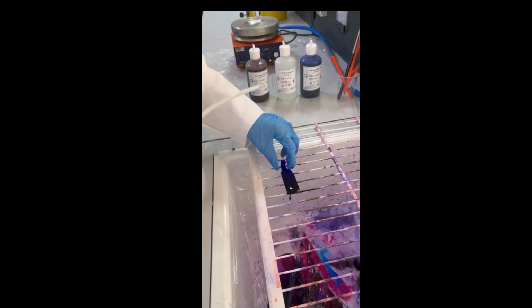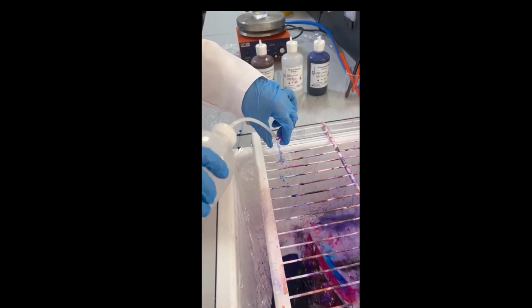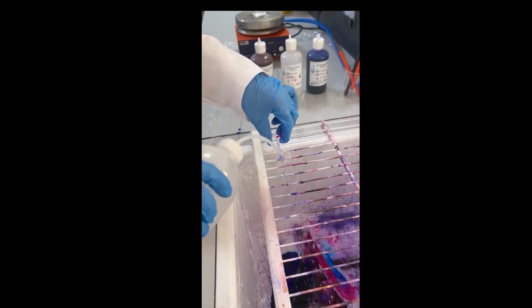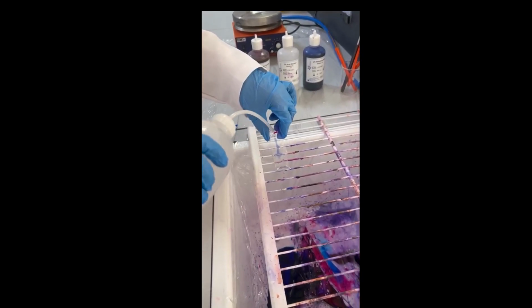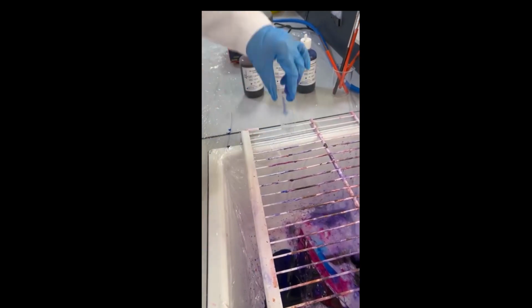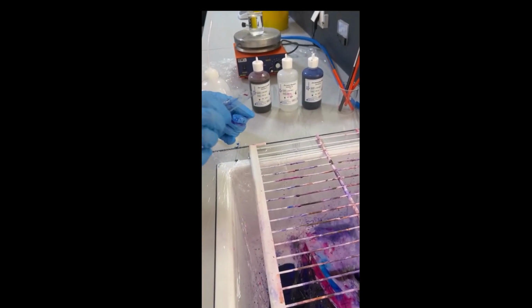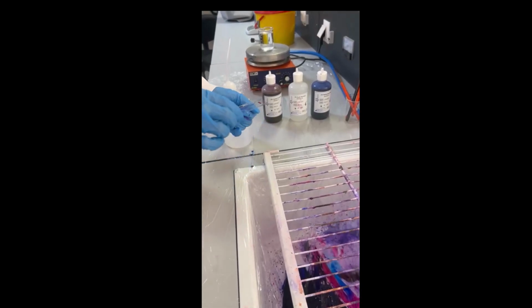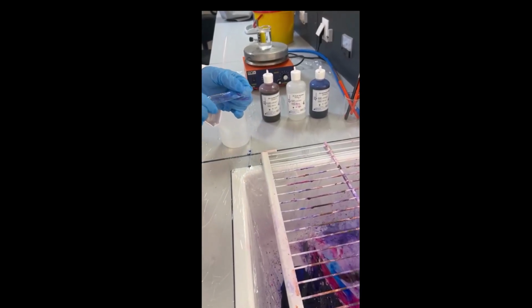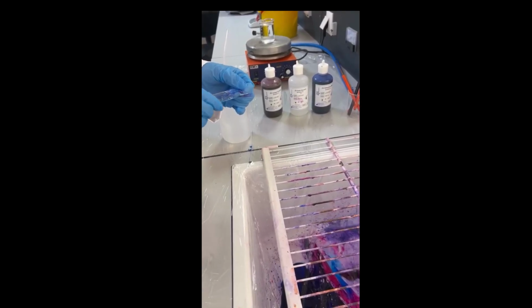After 1 minute, wash the slides until there is no more stain on the slide. Then we dry the slide and examine it under the microscope. And I will make available the slide that shows you the acid-fast stain and non-acid-fast stain.